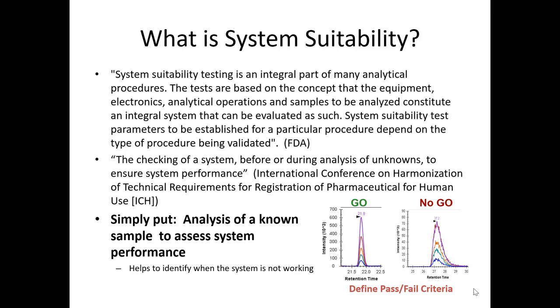And this is actually real data we acquired and plotted in Skyline in the very early days, where we had multiple labs running the same kind of analyses. They were all given the same sample. And this is the profile, mass spec intensity versus retention time for a bunch of transitions for one peptide. And this is what you would expect to see, a symmetrical Gaussian chromatographic peak, good intensity. The same sample performed on a different system, clearly there's something wrong with that, right? Not only is it visually asymmetric and tailing, but it's a lot less intense than the other peak. Unfortunately, it's not always this obvious.